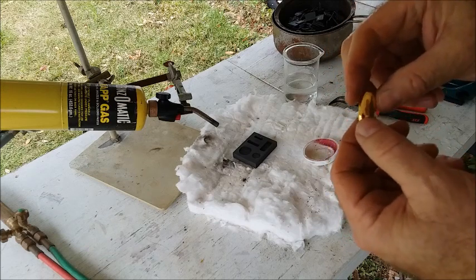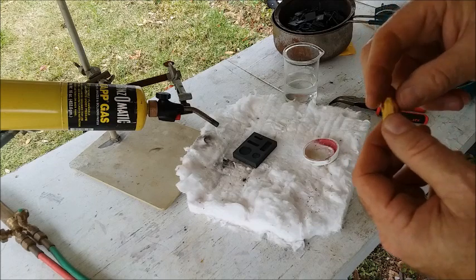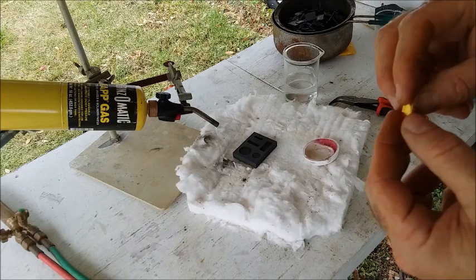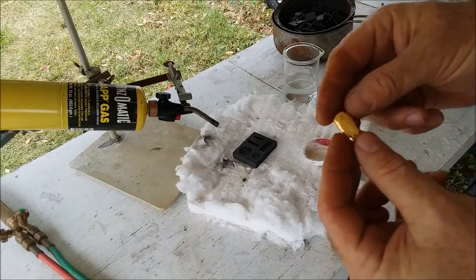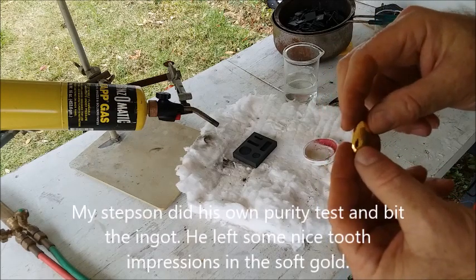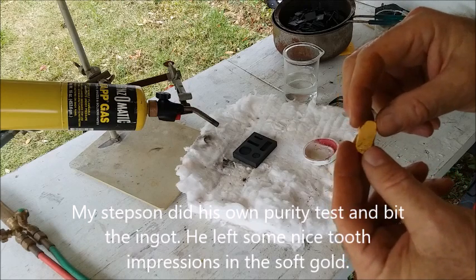I think I'll boil it in a little bit of sulfuric acid solution just to get off any residue from the borax flux. Then we'll see what they say about it at the jewelry store when I sell it. Hopefully their meter will go all the way to 24 karat this time — it sure looks a lot better than the ones I took them last time.